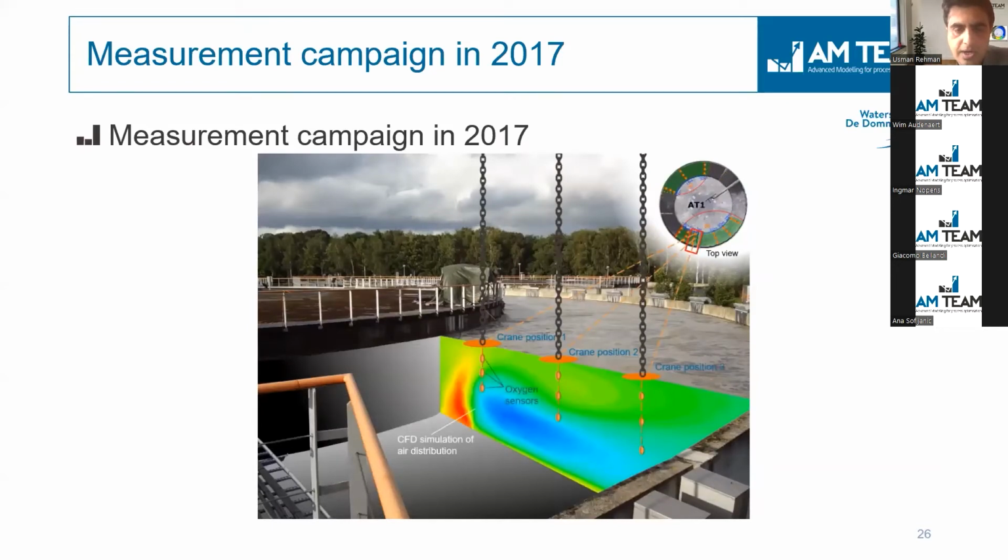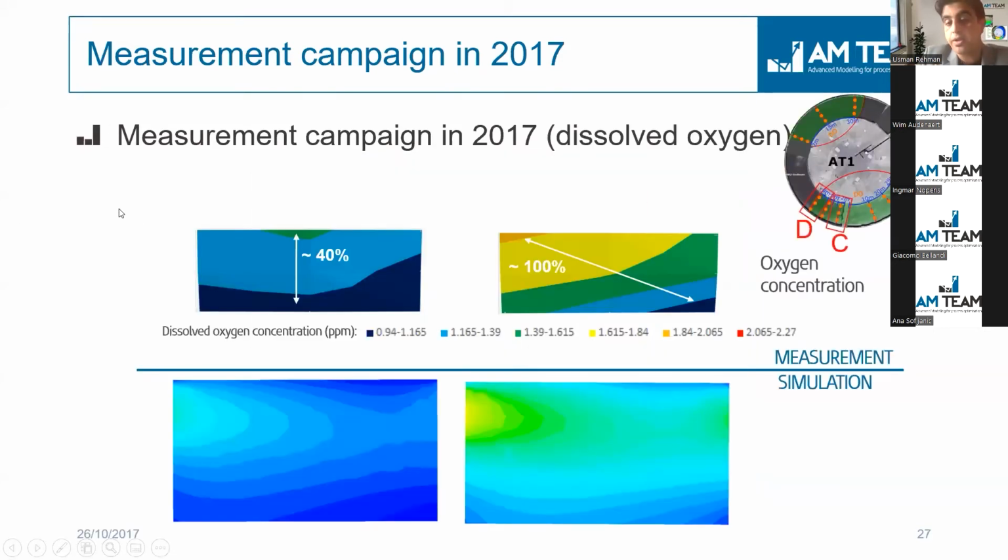And we observed that dissolved oxygen is not really constant, but is very varying, and it means that there are really gradients existing in such a big bioreactor as well, even in the very much aerated zone where the aeration was really happening.